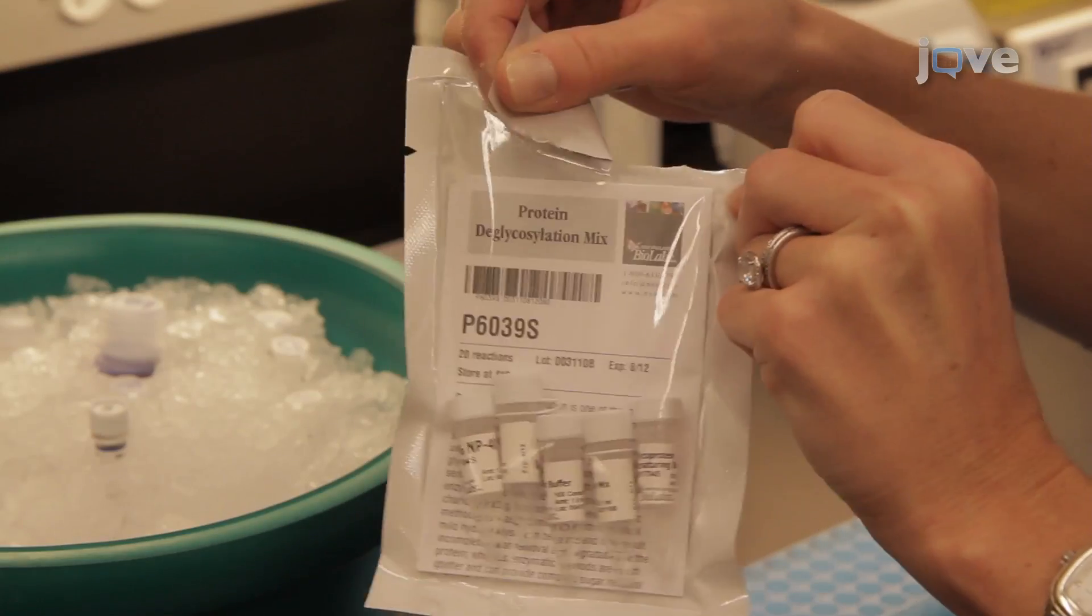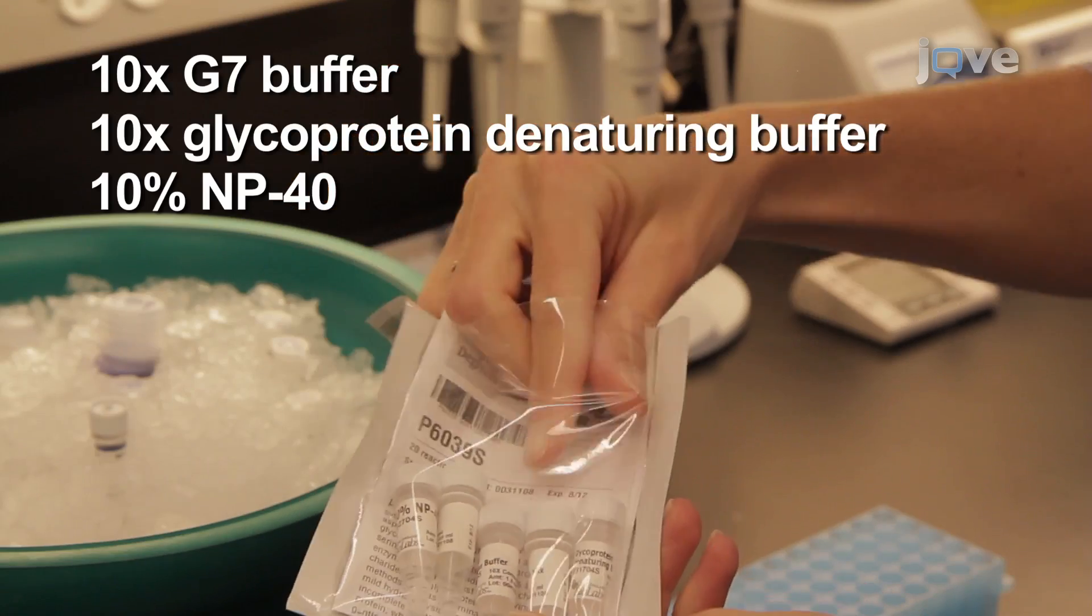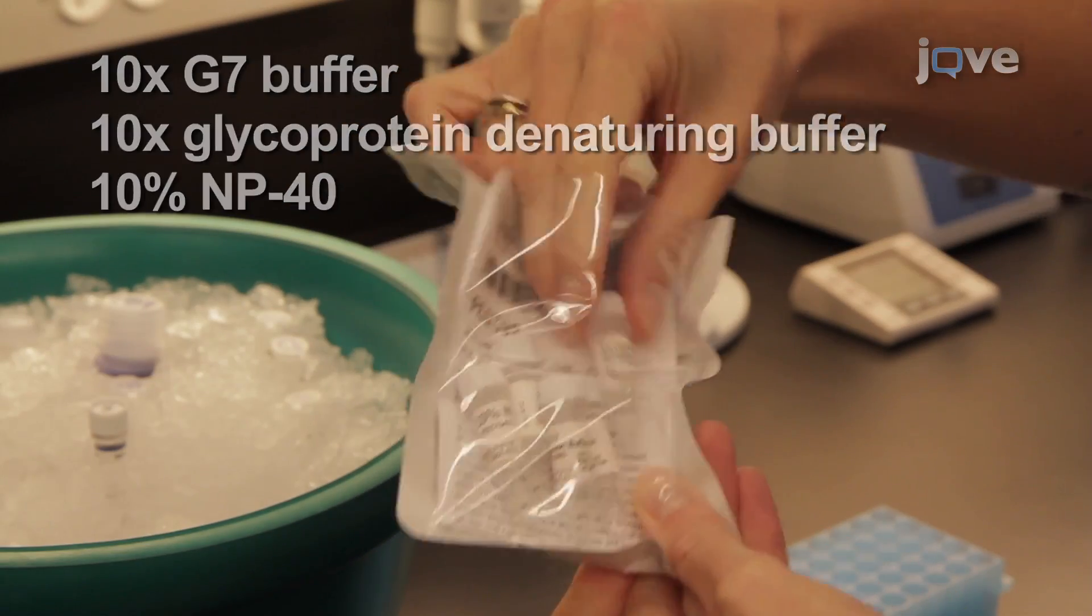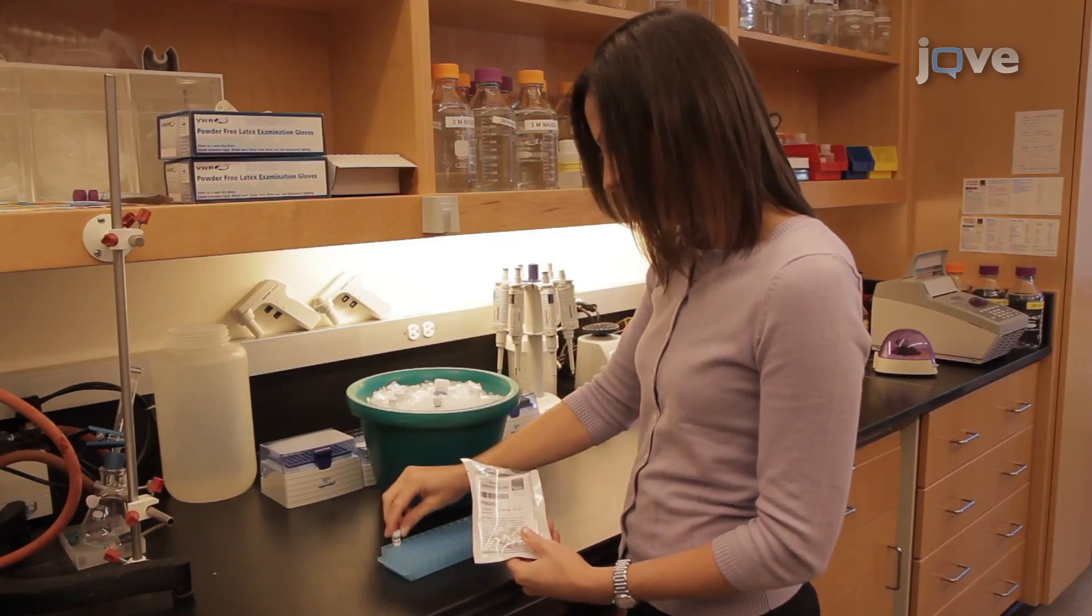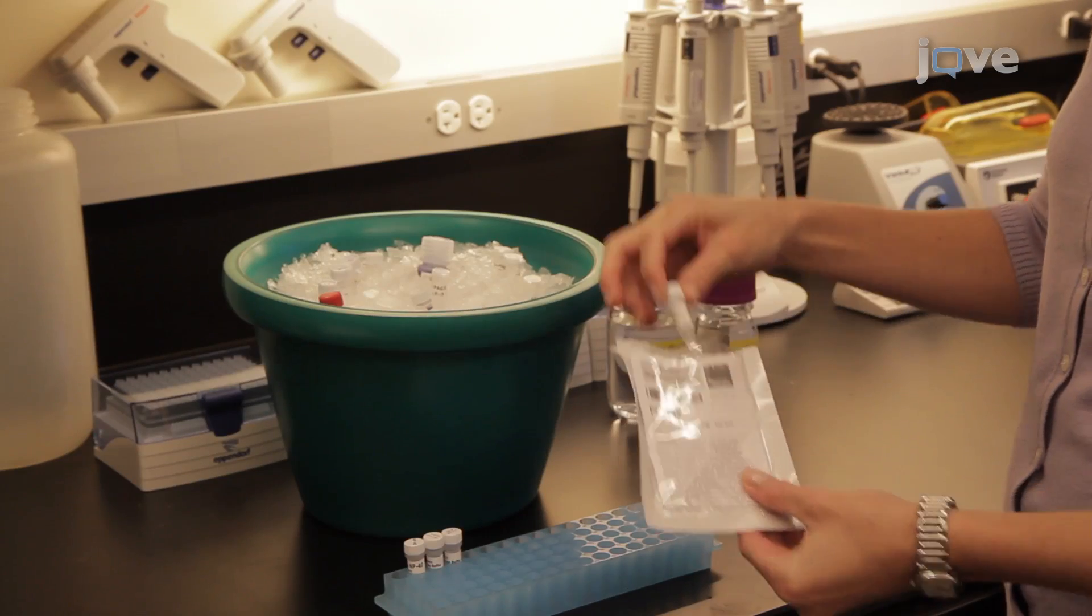To begin enzymatic deglycosylation, thaw the supplied buffers from the protein deglycosylation kit. Mix the tubes thoroughly and keep at room temperature. Place the enzyme-containing vials on ice.